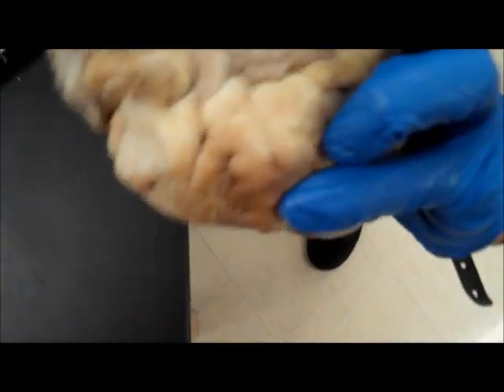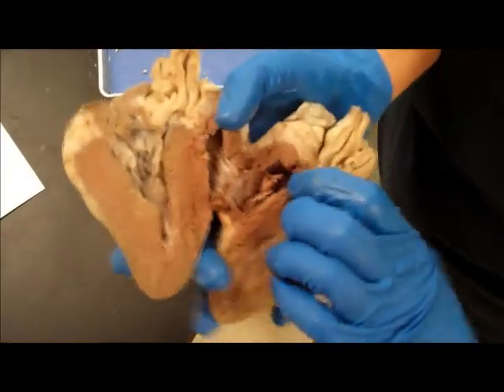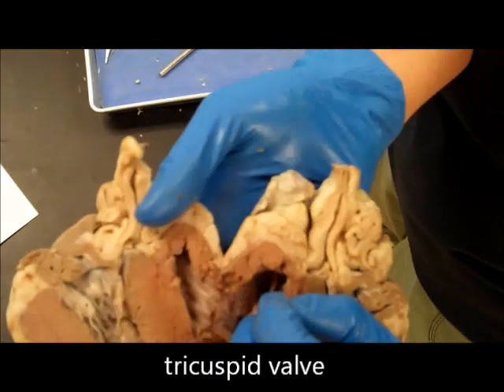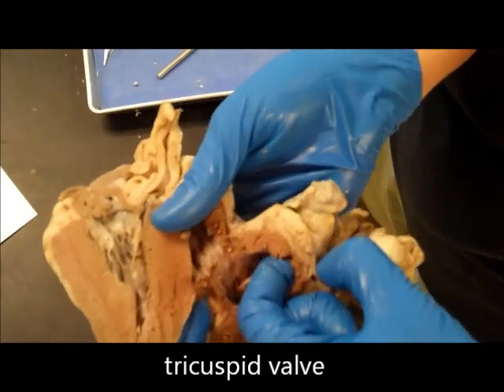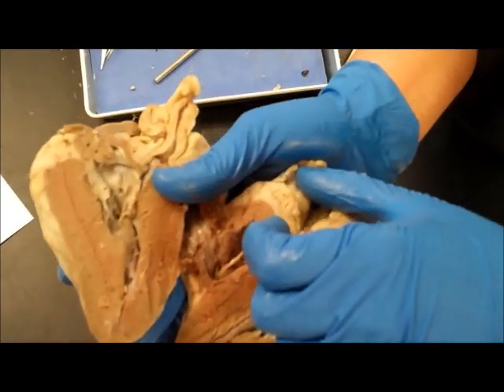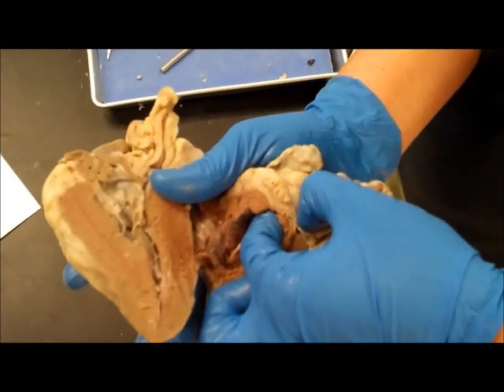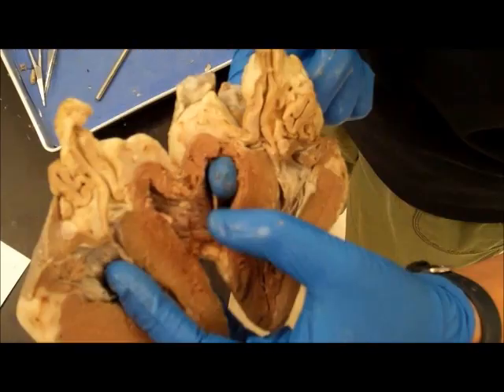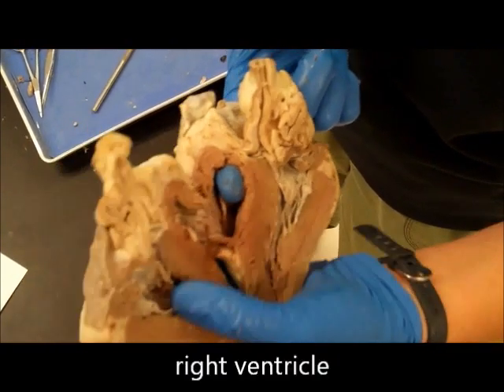Okay, so now we're going to open this heart back up. You have here the tricuspid valve, remnants of it, and this tricuspid valve is what regulates the blood flow between the right atrium and the right ventricle. It's what keeps blood from backing up into the right atrium when the right ventricle contracts. Passing now into the right ventricle.